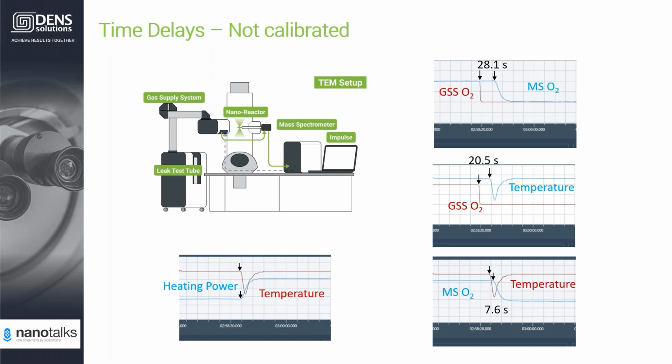Practically, as a system working under TEM, there is a lot of work you want to achieve from TEM. You want to bring a lot of things synchronized to the time clock inside the TEM. That's why you need a criteria or method to synchronize all the data to your TEM time.